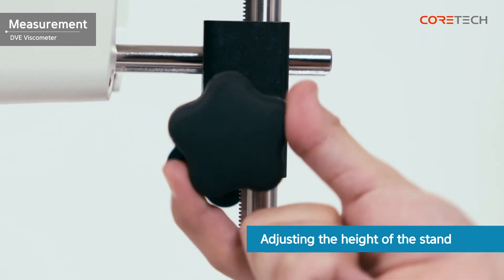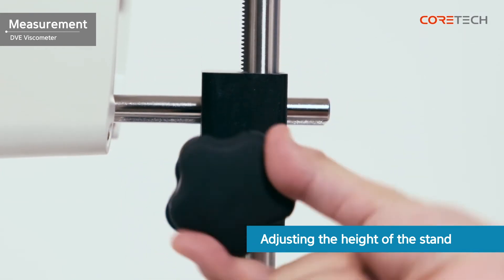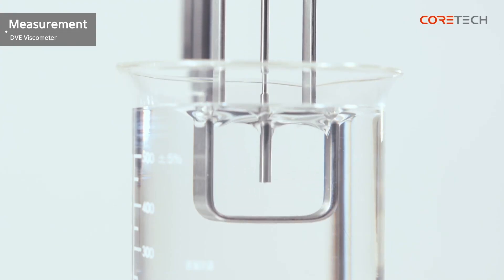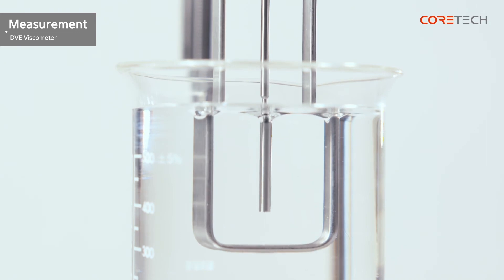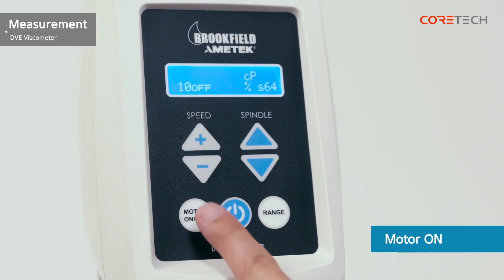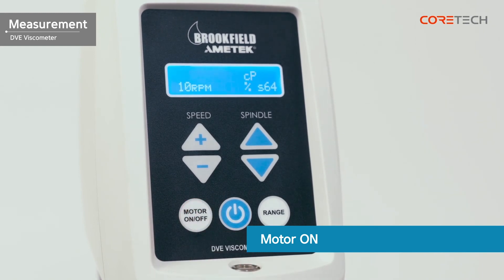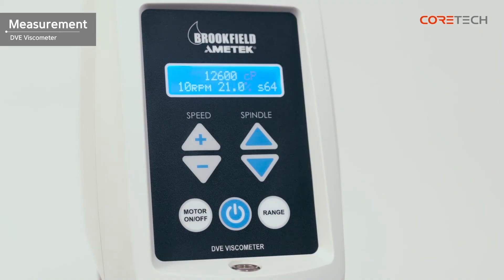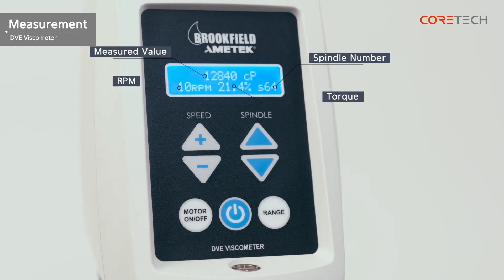Turn the height control knob to immerse the spindle in the sample to the marked groove. Press the motor on/off button on the bottom left. The display shows four figures, each representing the measured viscosity value, RPM, torque, and spindle number. After a certain period of time, the measurements stabilize and the measurement results can be checked.